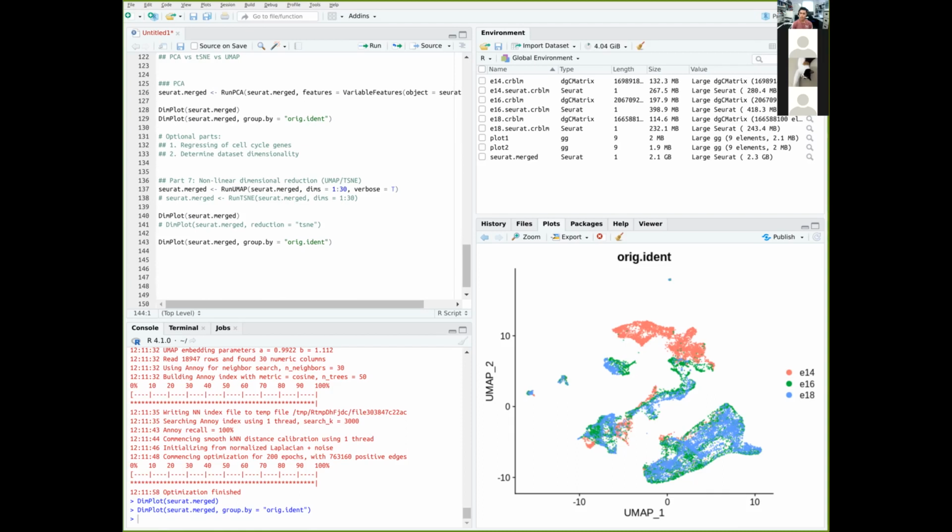Okay, so now let's start to plot out, because I think this is quite nice. And usually, if you are able to master the plotting, you can actually create very high quality plots for publication with very minimal modification.